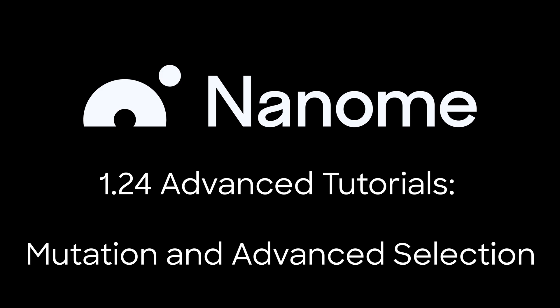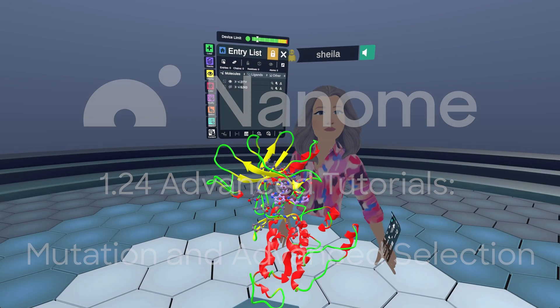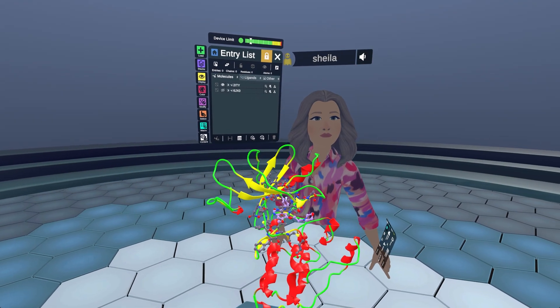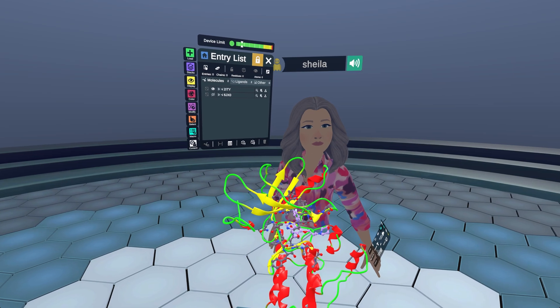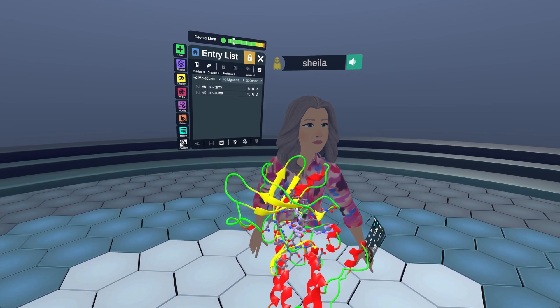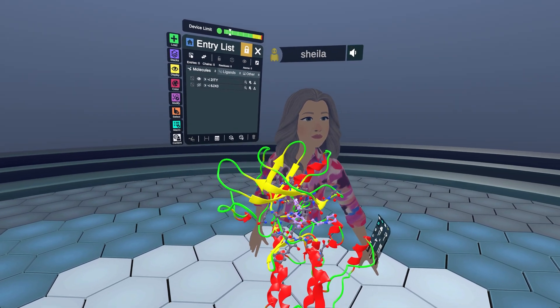Welcome to the mutations and selection methods advanced tutorial. My name is Sheila and today we'll be looking at how to use the hierarchy and selection menus to quickly find residues, as well as take a look at the mutation tool.